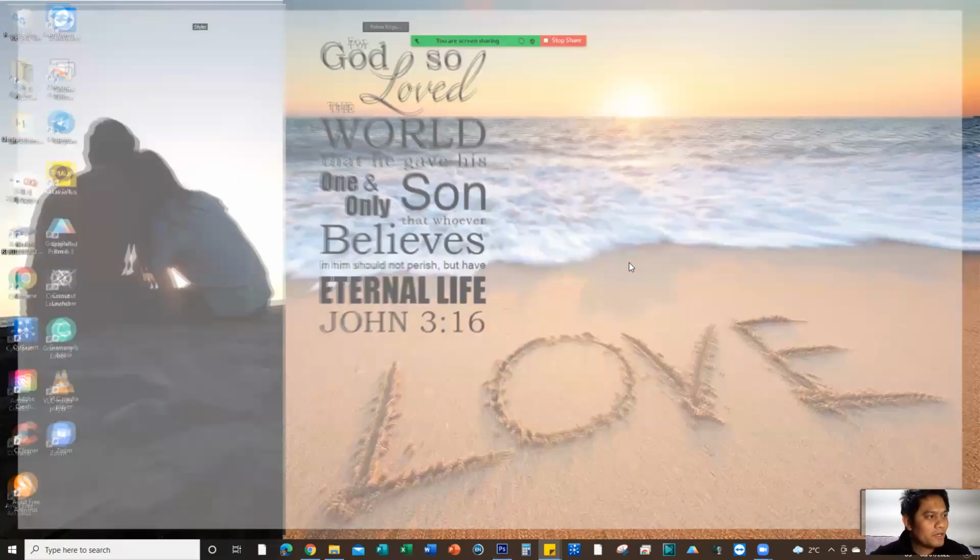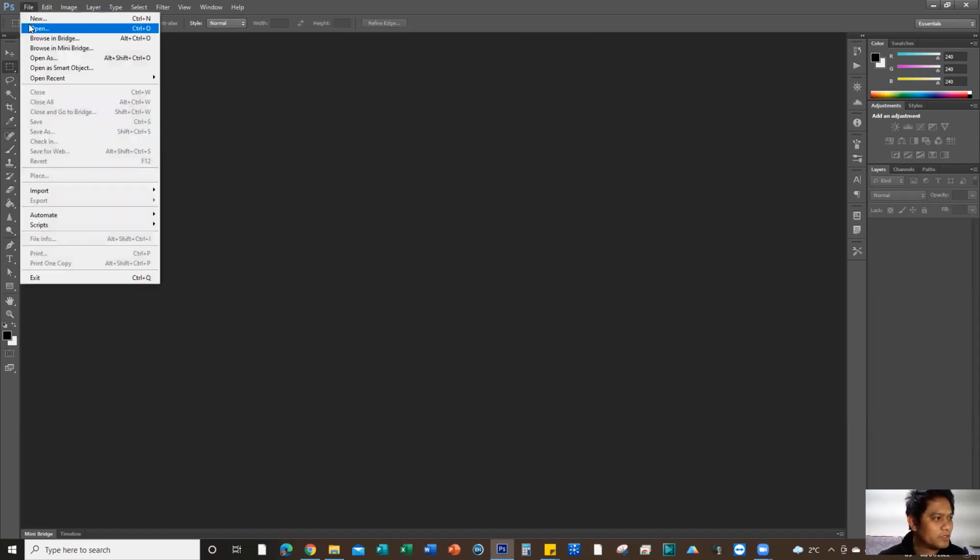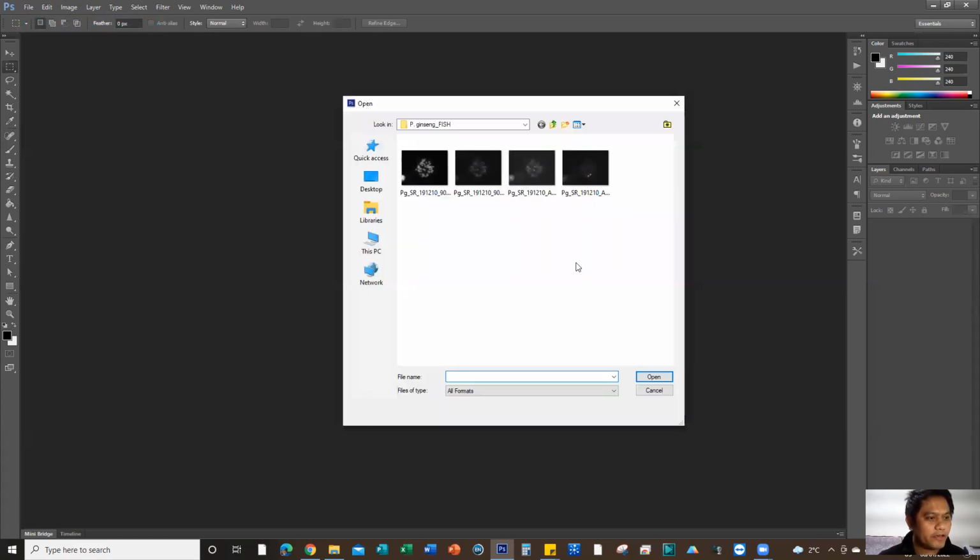To start, let's open our Photoshop and insert our fish data. So by clicking File and then Open. In my case, I'm using the Panax ginseng as a sample in this video. And I have the fish signals of 5S, 45S, and telomere here.